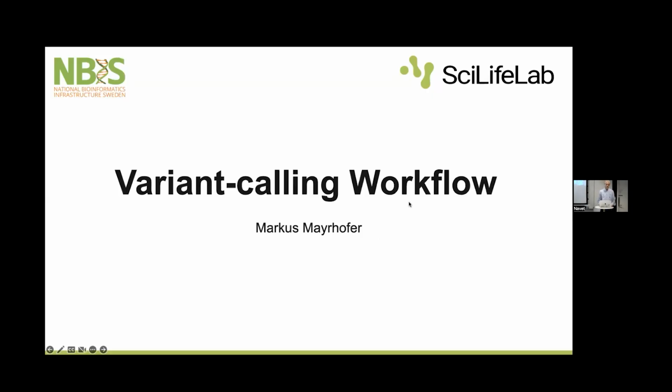So welcome to the session on variant calling. We met yesterday for the QC session, and today we will continue with a variant calling workflow.